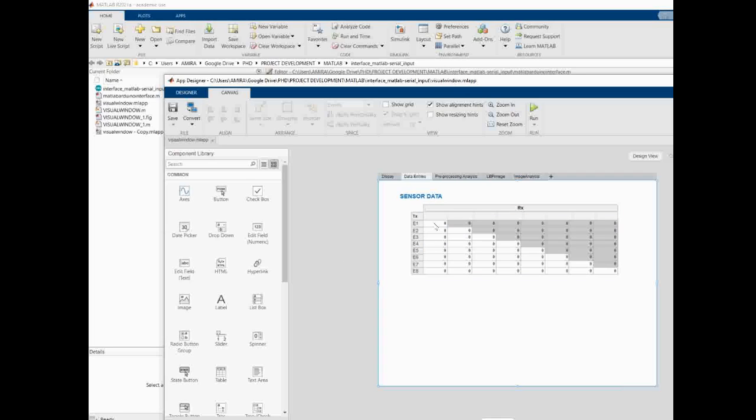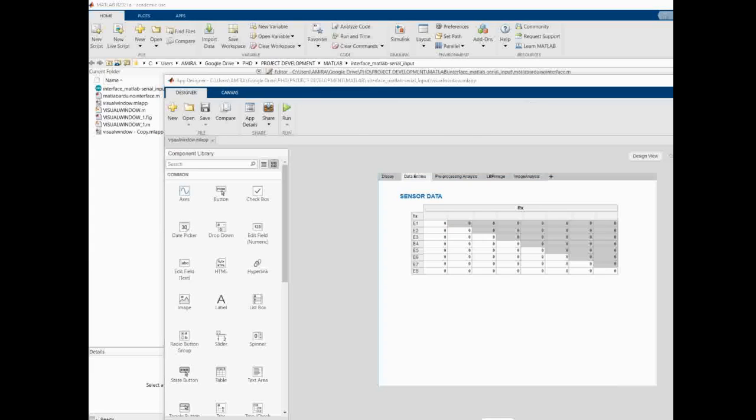So I wanted to do the big steps to solve the main problem, which is getting used to designing in App Designer and getting used to the coding of this thing. Yeah, and then I will proceed with the correct measurements of the electrodes using the breadboard. That's all.